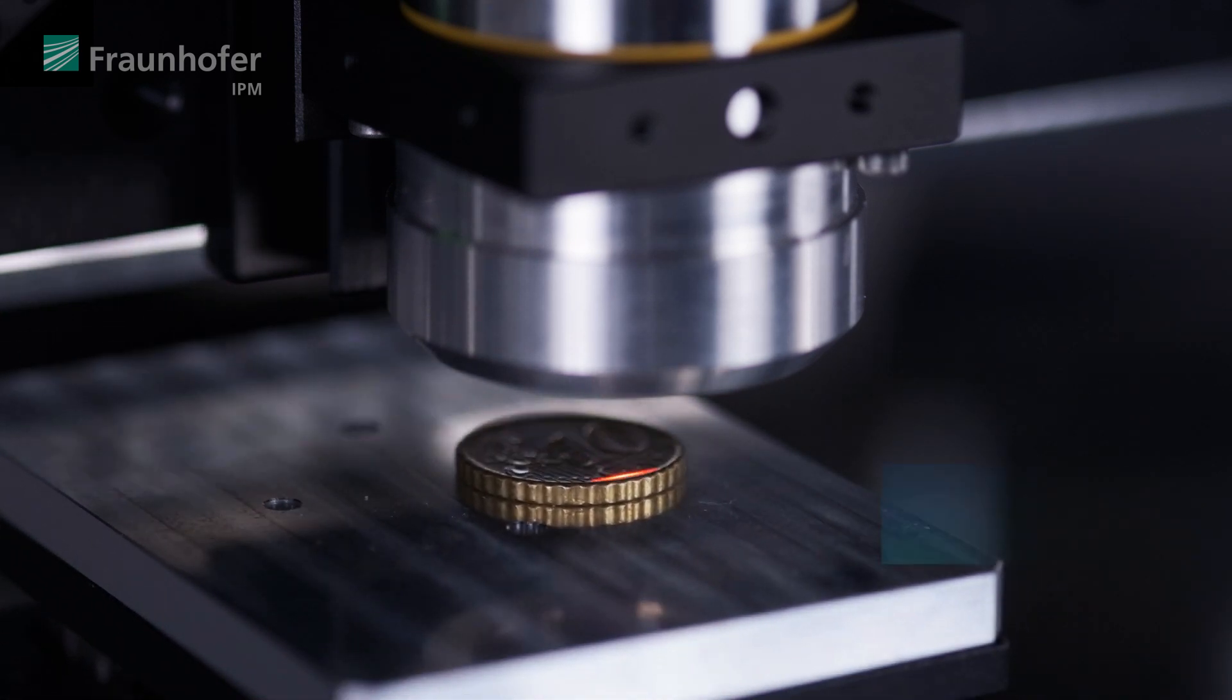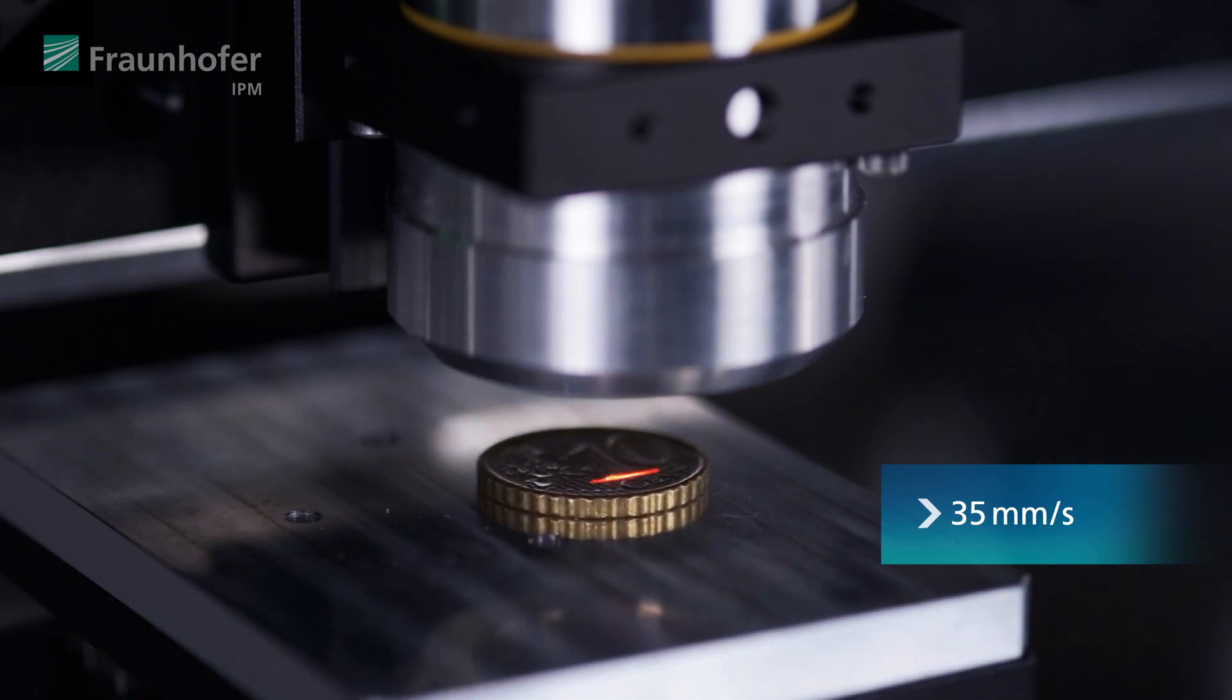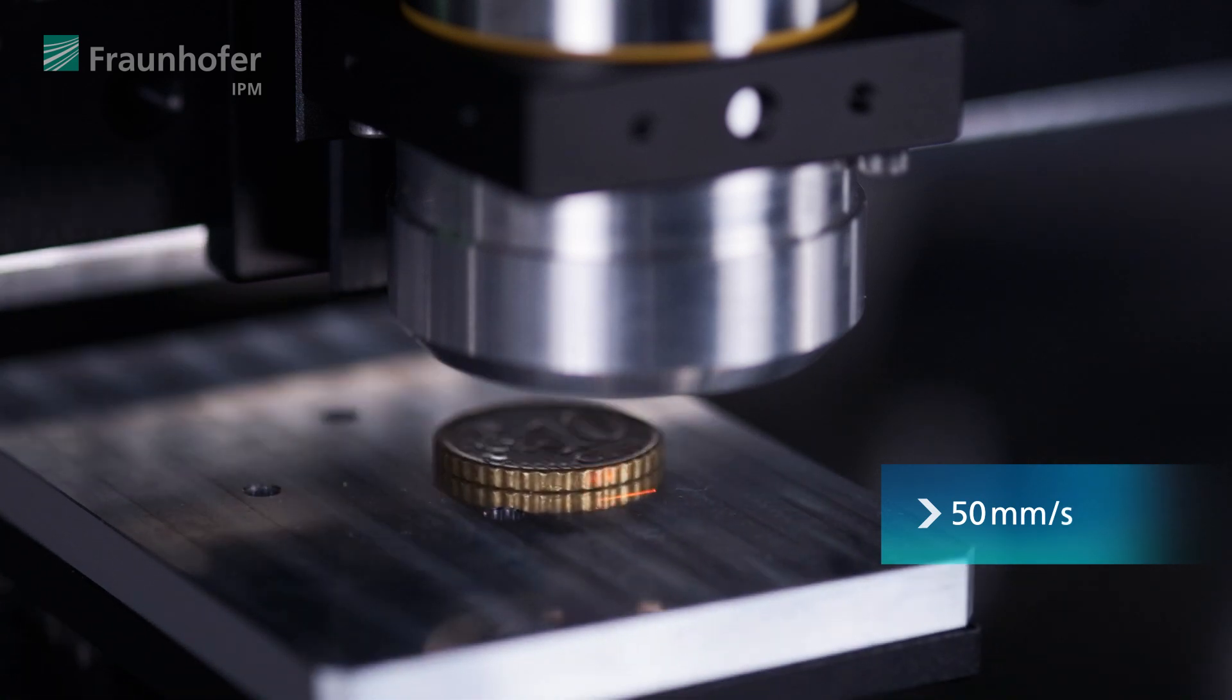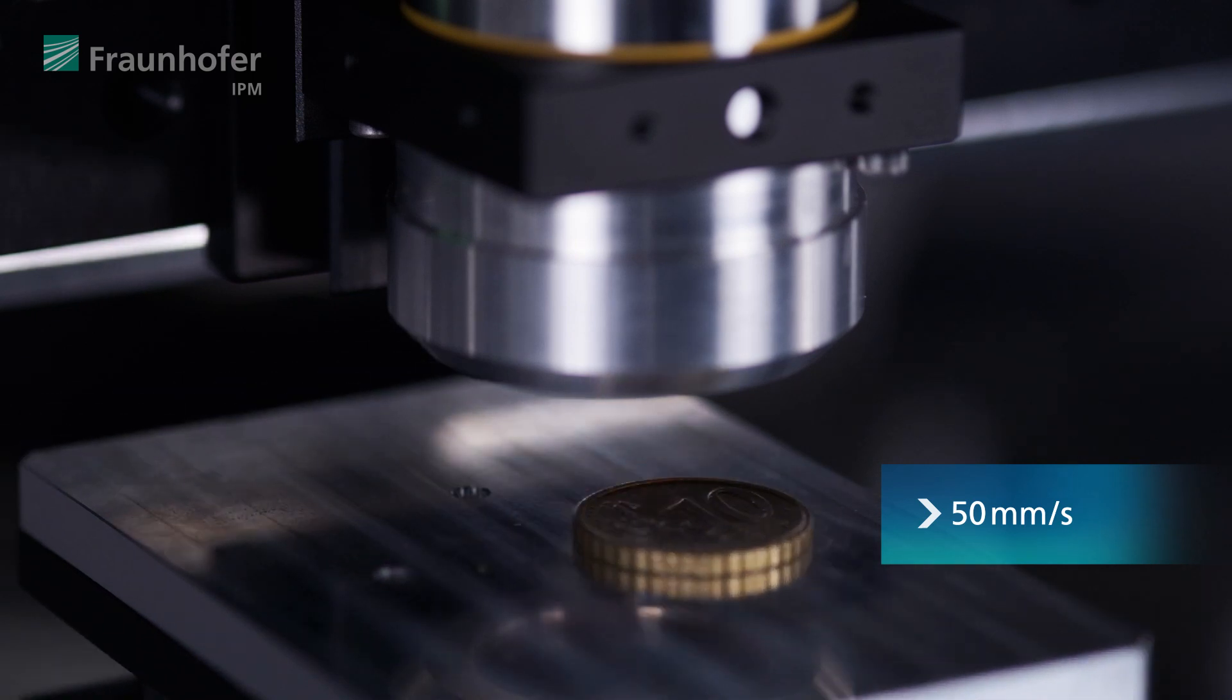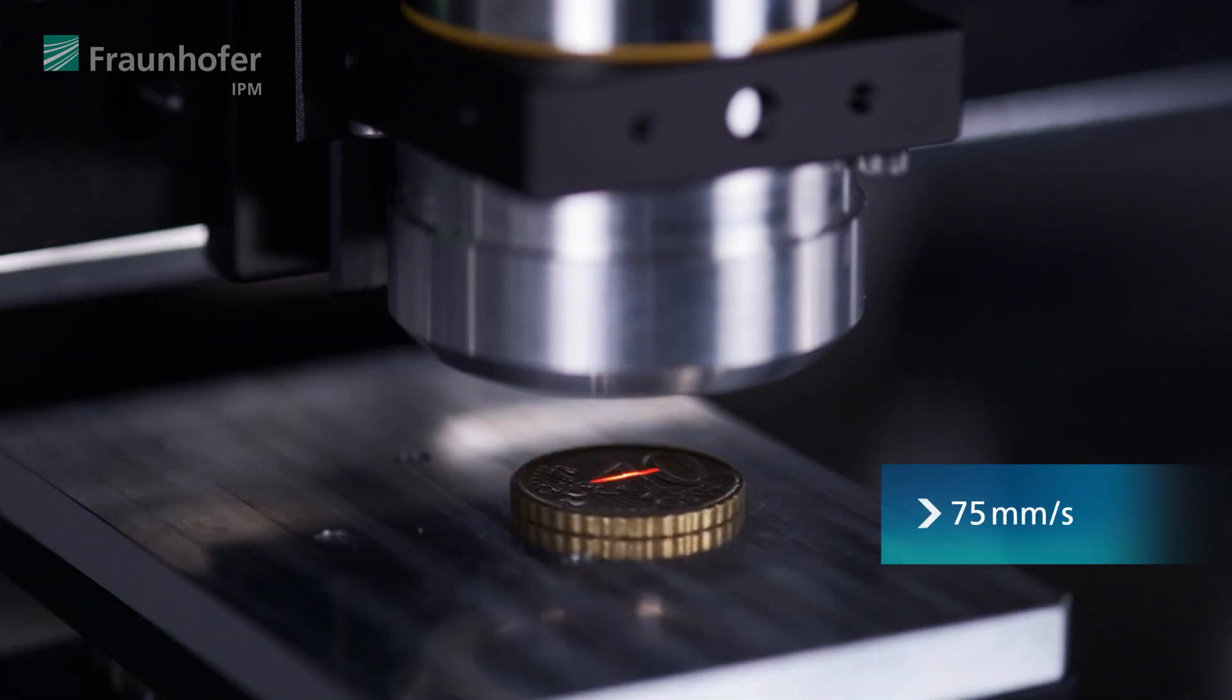But 35 mm per second was just the beginning. We tested even larger velocities: 50 mm per second, and even 75 mm per second, which is really fast.